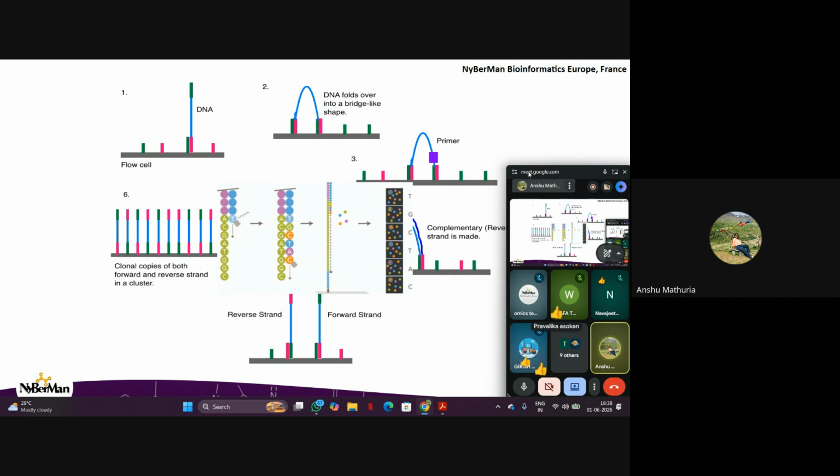Okay. So you guys have seen a glass slide, right? A normal glass slide is just a small rectangular glass piece. But for this, we have a small glass slide that is carved a little from inside. So you'll have a small well inside so that the water can flow and be retained in that glass slide. So there will be some depression, and that particular slide is called a flow cell.